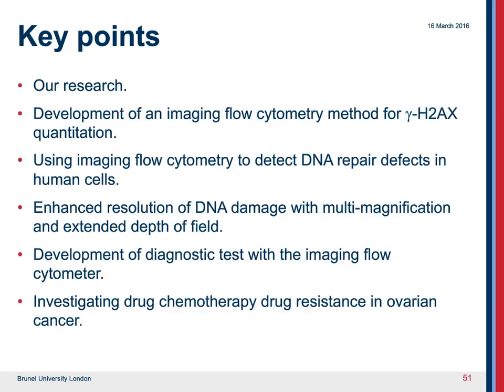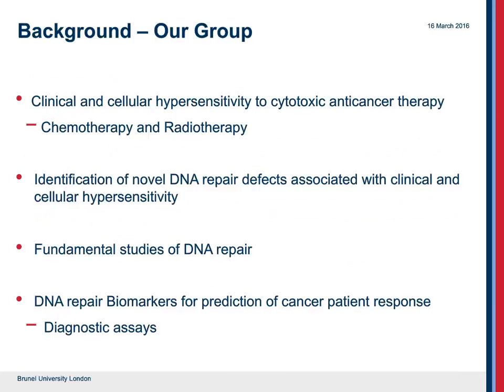So the background to our group is we are very interested in clinical and cellular hypersensitivity to cytotoxic anti-cancer therapy, namely cytotoxic chemotherapy and radiotherapy. We've also in the past identified novel DNA repair defects that are passed on in an inherited fashion that are associated with clinical and cellular hypersensitivity. So therefore we've done fundamental studies of DNA repair. And as I said earlier in the slide, we're really looking at the development of biomarkers for the prediction of cancer patient response, and we hope that the imaging flow cytometer will be central to many of these developments as we go forward.